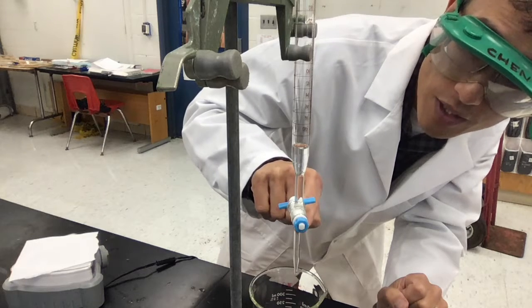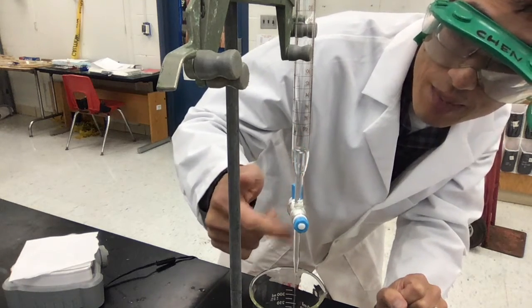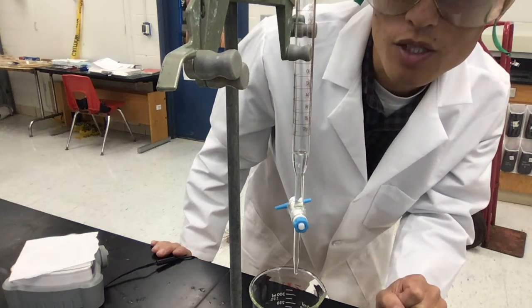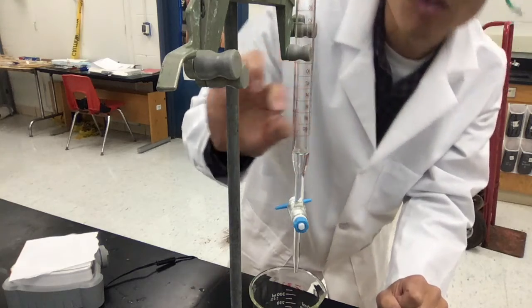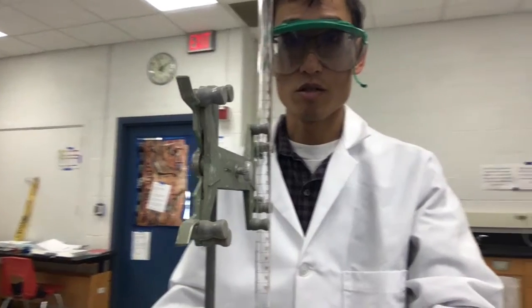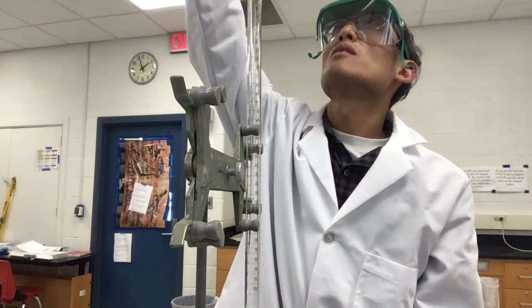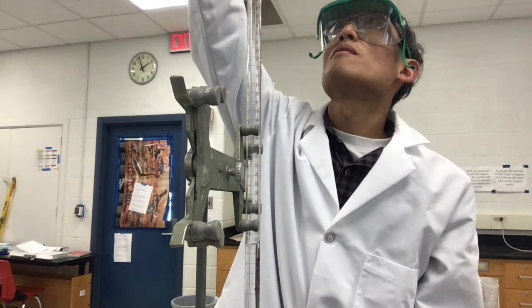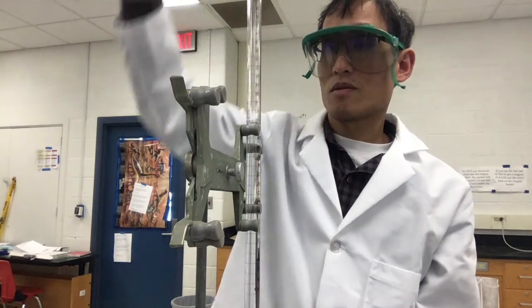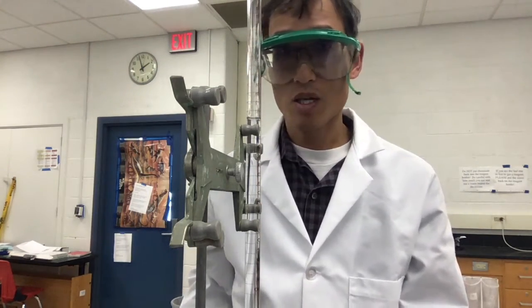If you have bubbles, you want to make sure you run them through and tap this to get rid of the bubbles, and then close that up again, because the bubbles are going to affect the volume you read. Once you have that set up, you're going to fill this up to a level. Okay, I'm going to put that like there, because then you can read it easier.